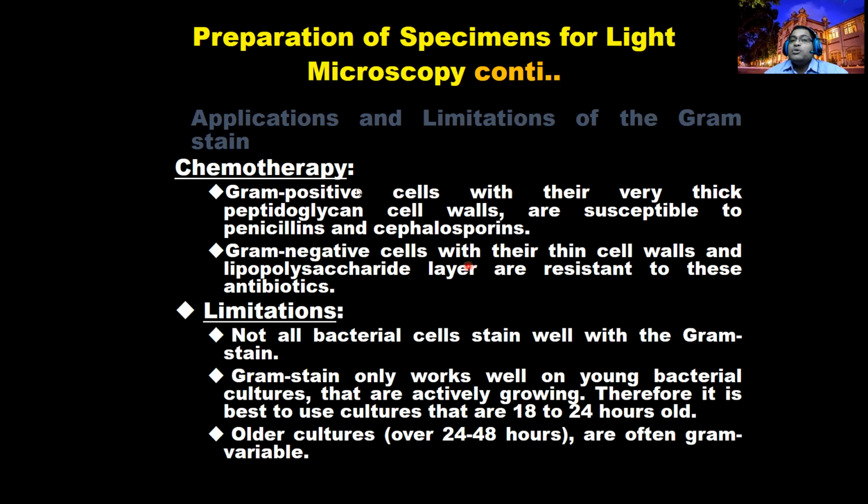Right? So that's a chemotherapy purpose. The limitations: what is the limitation? Not all bacterial cells stain well with the gram stain. Not all. It only lets you differentiate, and it's not an exact differentiation. Some bacteria will not stain.